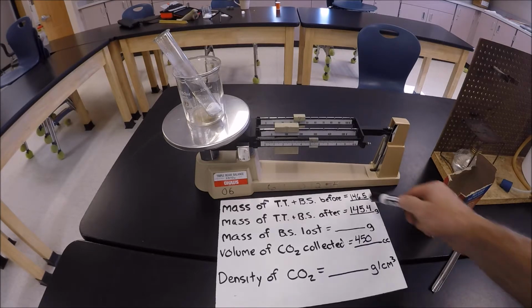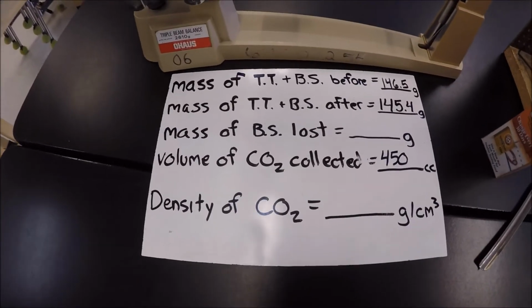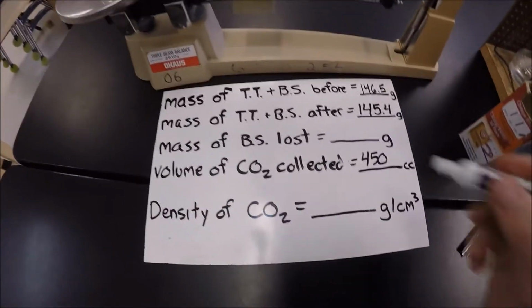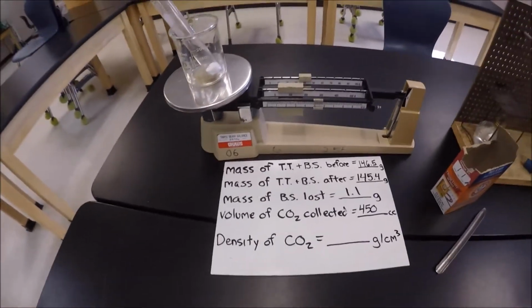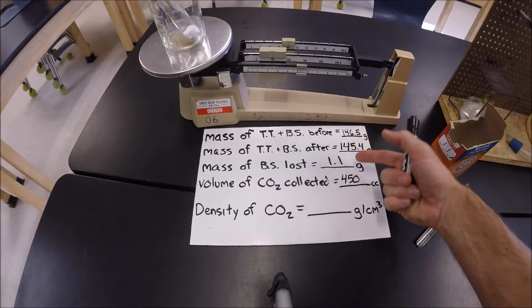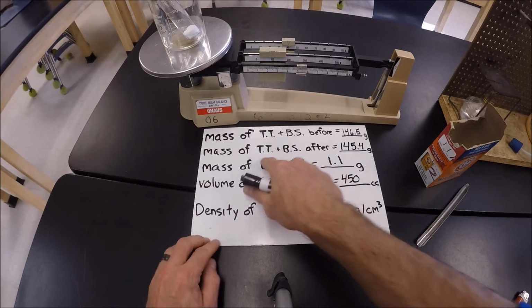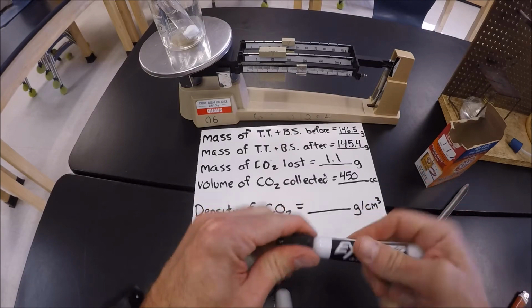Now all we have to do is look at how much was lost. How much baking soda was lost in this situation? It went from 146.5 to 145.4, which tells us that essentially we lost 1.1 grams. At this point, we know that the mass of the carbon dioxide lost, pardon me, I should have corrected that, it should be mass of carbon dioxide lost. Let's just change that. It was 1.1 grams. We collected 450 cc's.